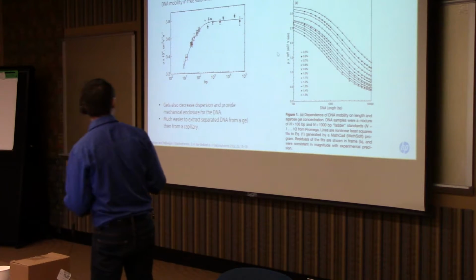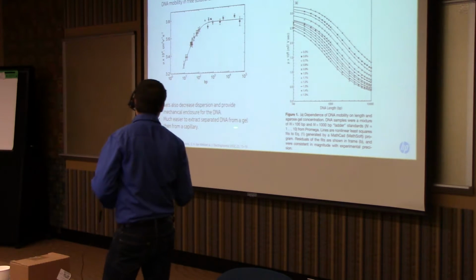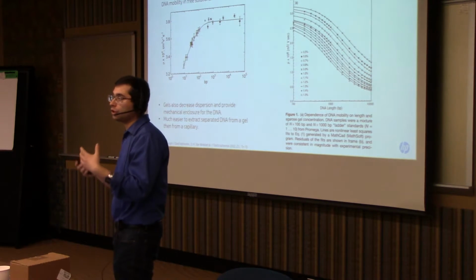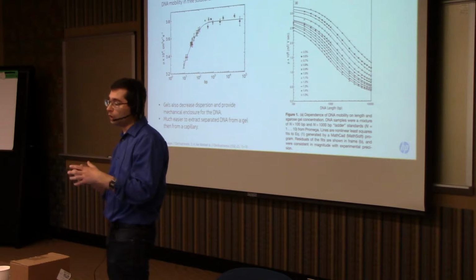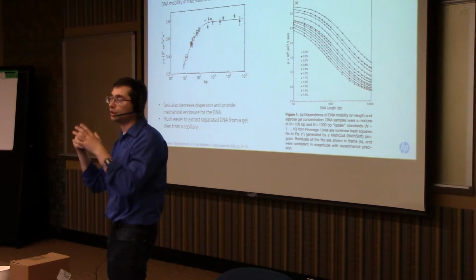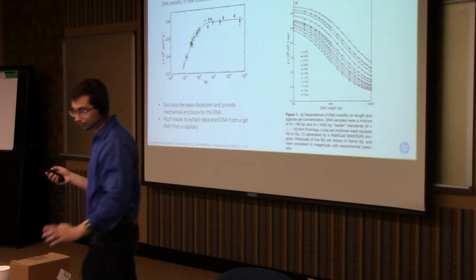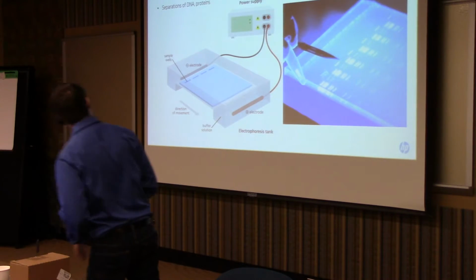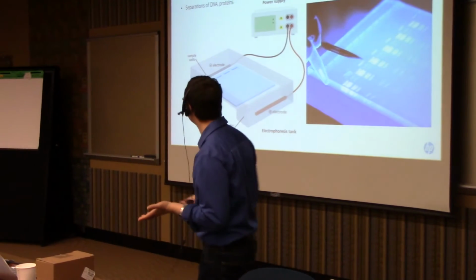And there's also another advantage to gels: once you have the gel, it just sits there. The gel limits the diffusion of the DNA, so as it's traveling, it's not diffusing as much inside the gel. Okay, so how do you actually do this in practice?